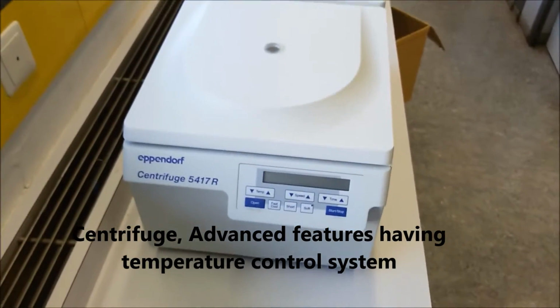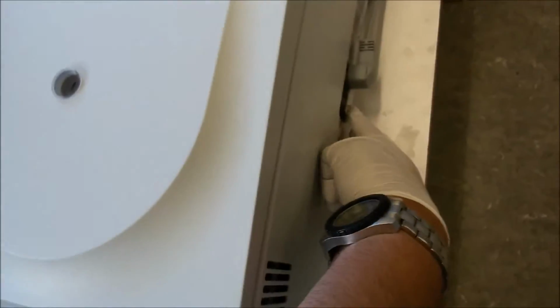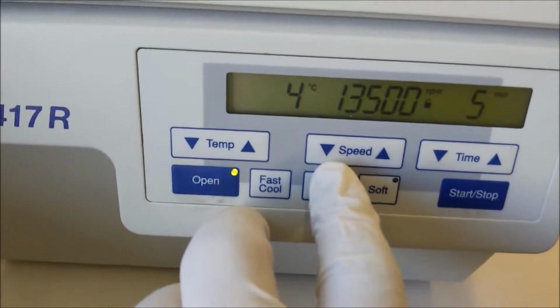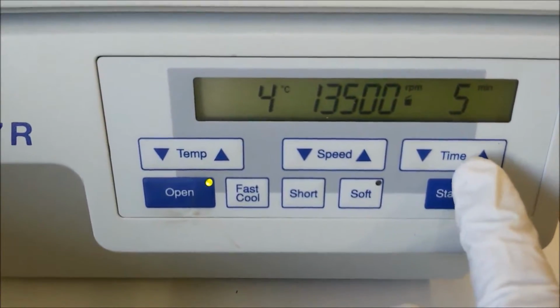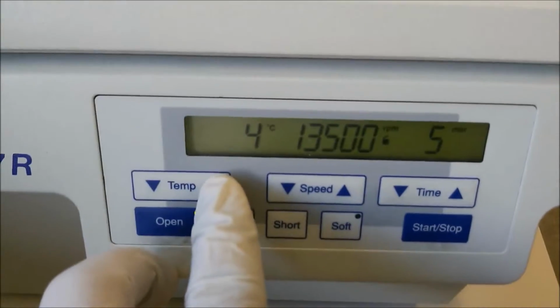Okay, so now I will introduce you to another centrifuge. This is also the same company, but I have to switch it on from here. Now it's switched on, you can see the display. So it has a speed button, it has a time button, but together with that it has a temperature button. So right now it's set for 4 degrees.